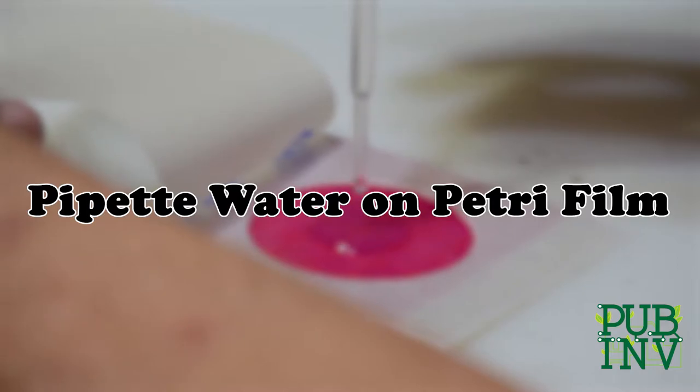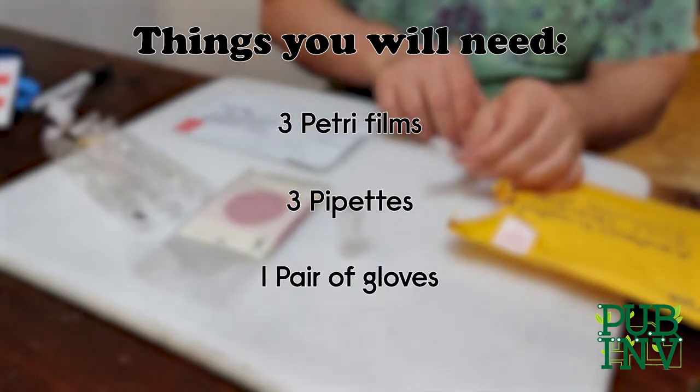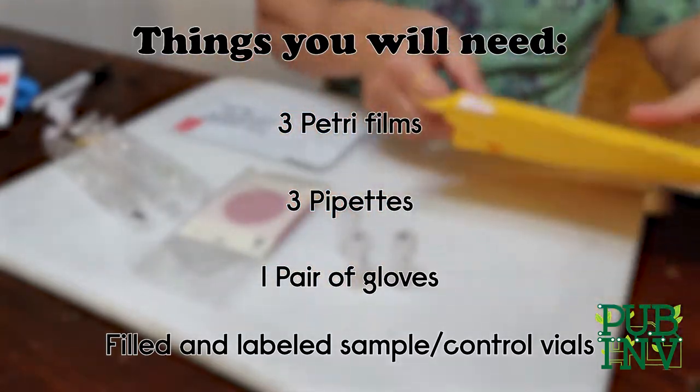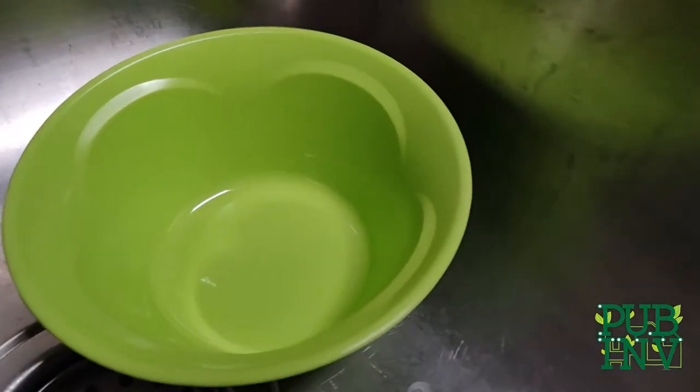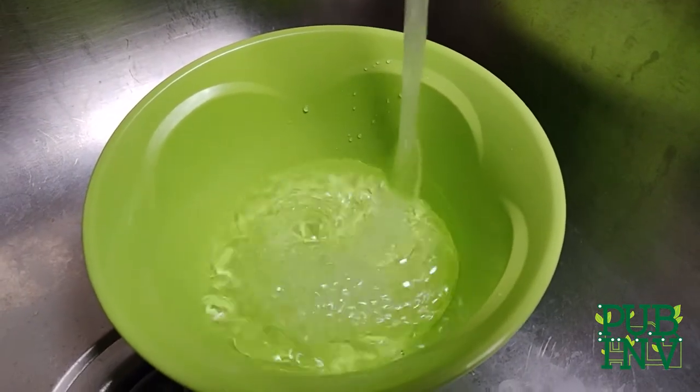Step 2, pipette water samples onto petri films. For this step, you'll need the 3 petri films, 3 pipettes, a pair of gloves, and your filled and labeled sample and control vials. You should have petri films labeled A, B, and C, with C being your control film, which will be filled with tap water from your sink. You can use a clean cup to collect some water to pipette with.